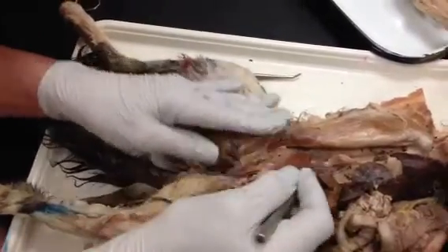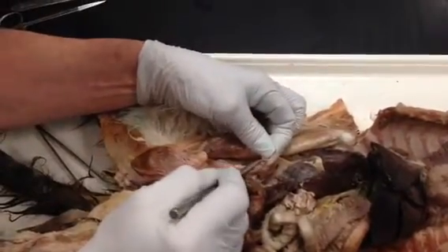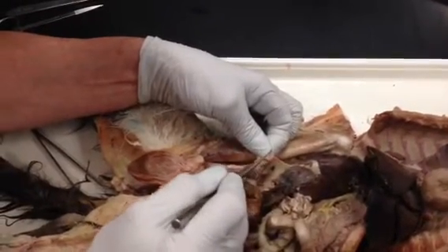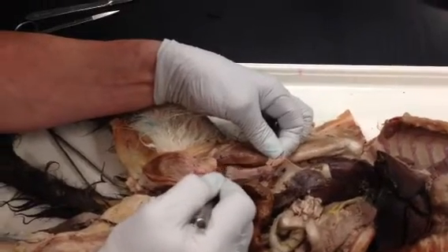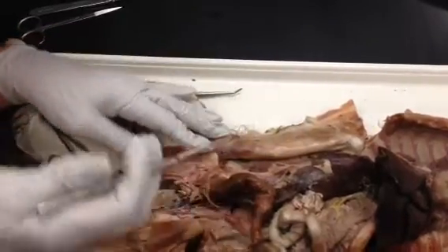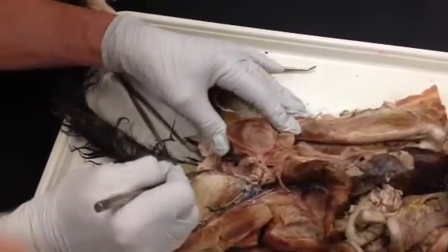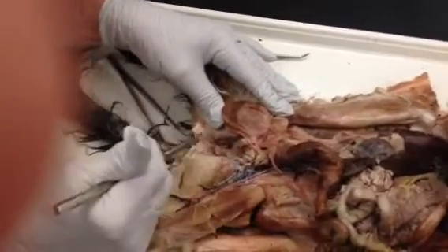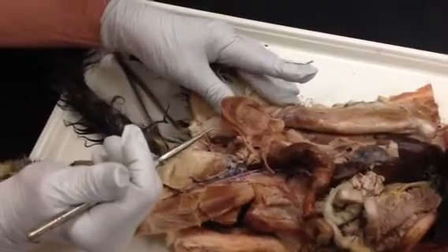The kittens will form after conception. The egg would be collected by the fimbriae of the oviduct, and then implantation would occur in the horns of the uterus. Then they would travel through the body, past the cervix and the vagina, and exit through the urogenital sinus. So one passageway serves two purposes.